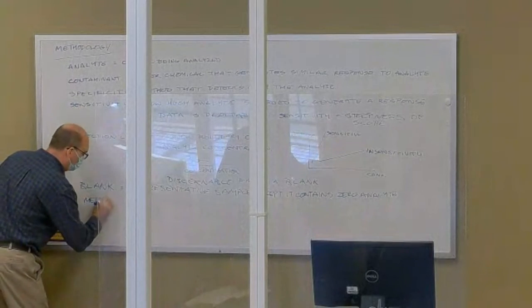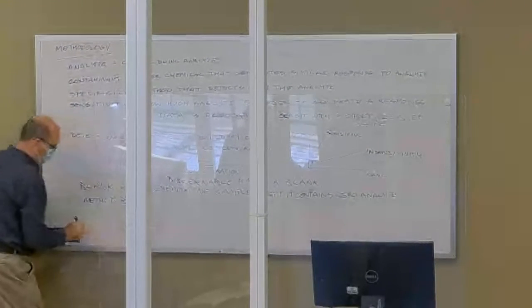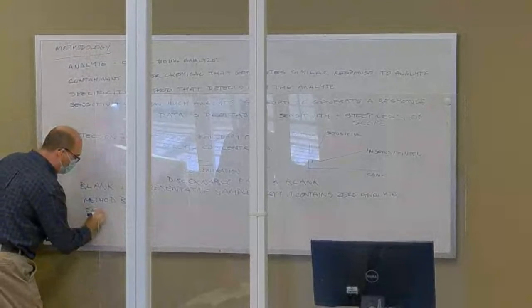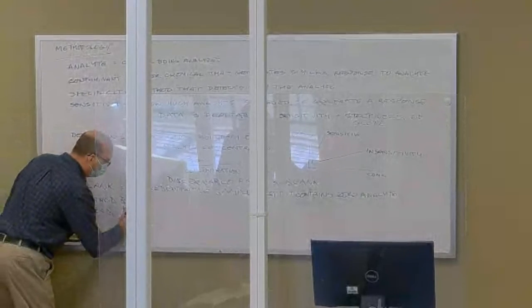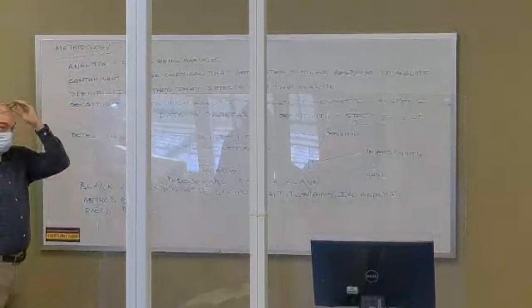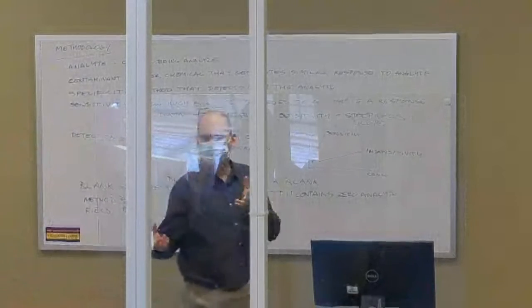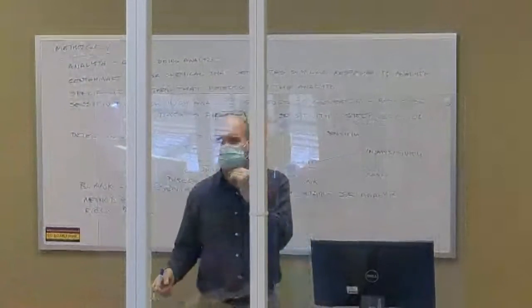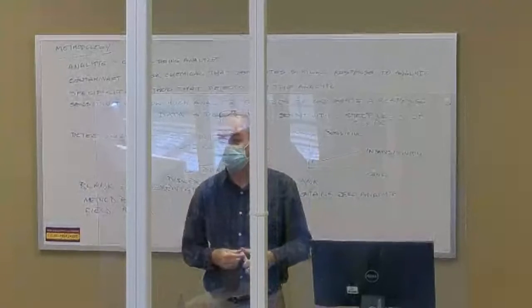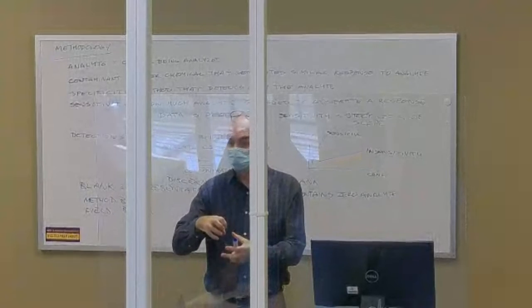And we have 2 specific types of blank that are called method blank and field blank. And a method blank, you know, if you're all too young, but there was a case, gosh, it was the 80s, late 80s, early 90s, where somebody poisoned Tylenol before the bottles were secure.